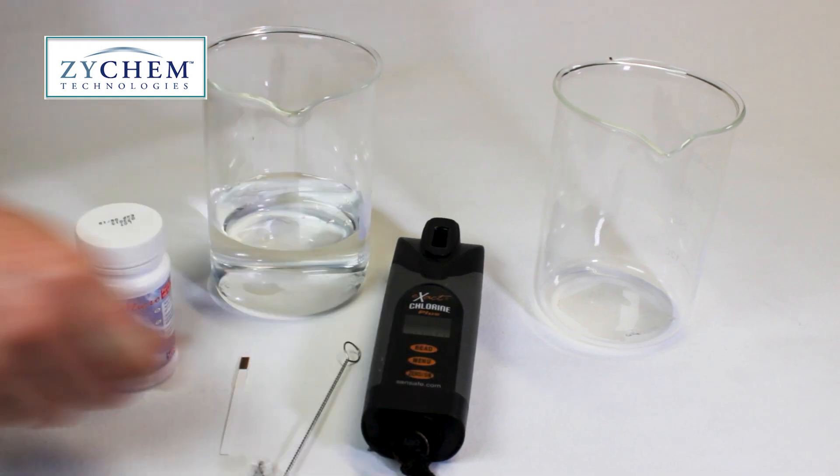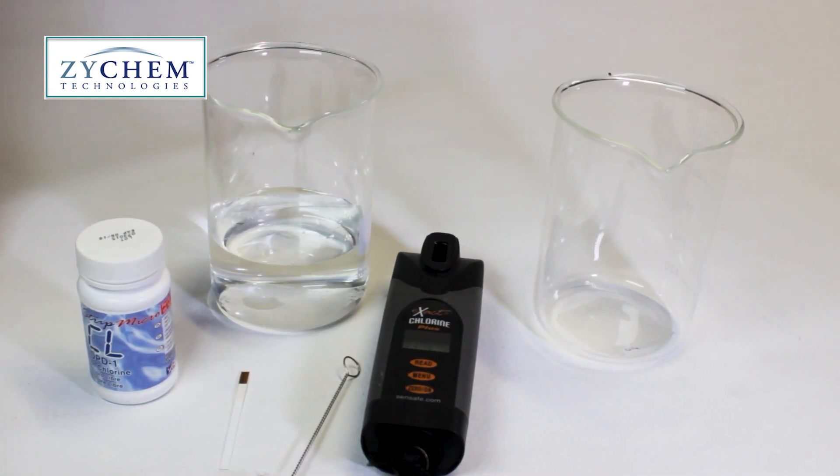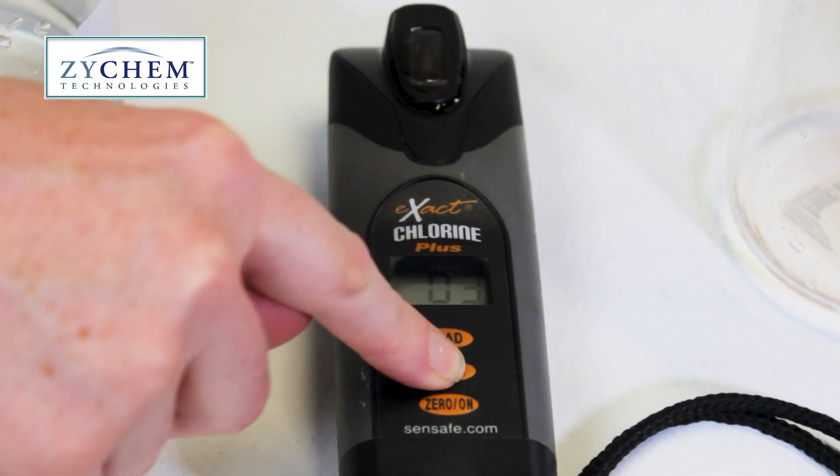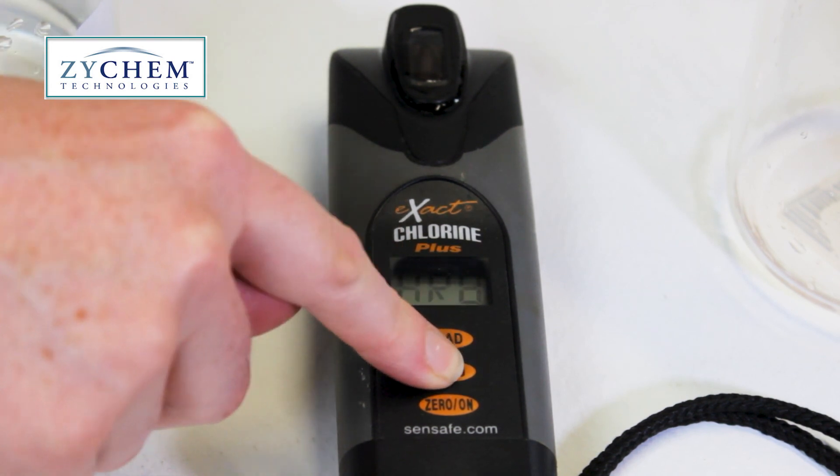Next, turn the photometer on using the zero on button if it's not already on. Use the menu button to toggle through to the menu item CL1, which is our selection for testing free chlorine.